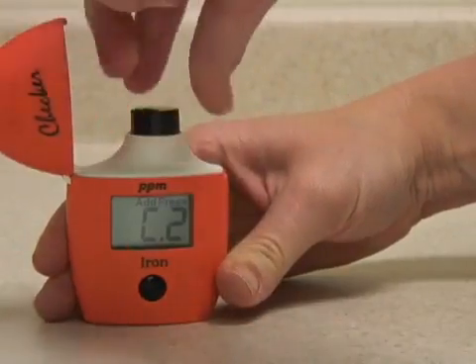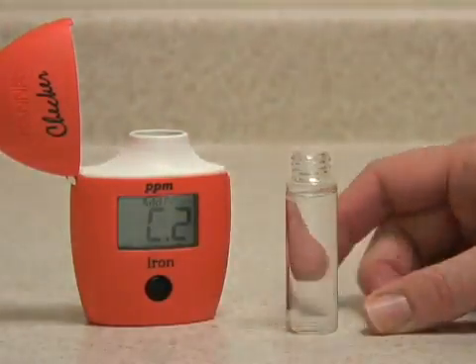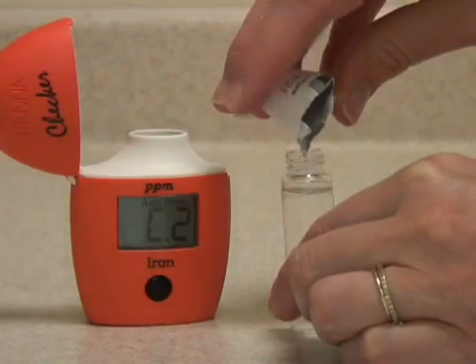It displays C2, so remove the vial, take out the cap, and add one packet of iron reagent. Try to get as much reagent into the sample as possible.